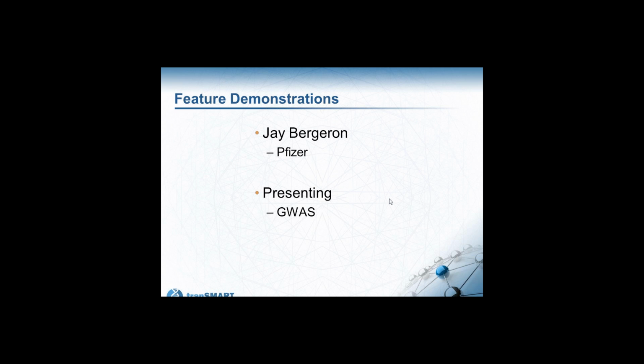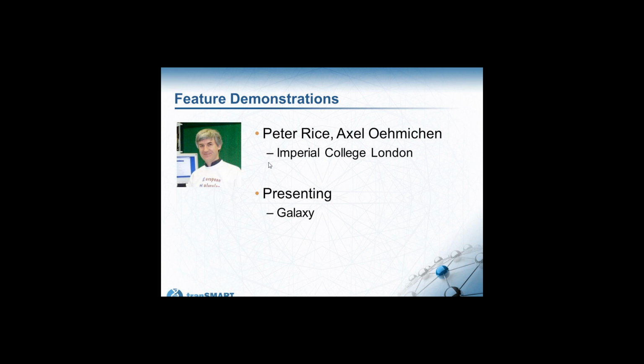Okay, yeah, that'll be something maybe we can put up for further work. I'm very excited about using this tool here in Michigan, and I'm sure it's going to see broad use throughout the community, and it's going to be a big highlight for us. And seeing how we can integrate this with other tools, we've got a nice pipeline we've developed where this GWAS would be part of it, and we'd be happy to share that capability with the community at the upcoming international meeting in mid-October. Thanks so much for this. This is a great contribution.